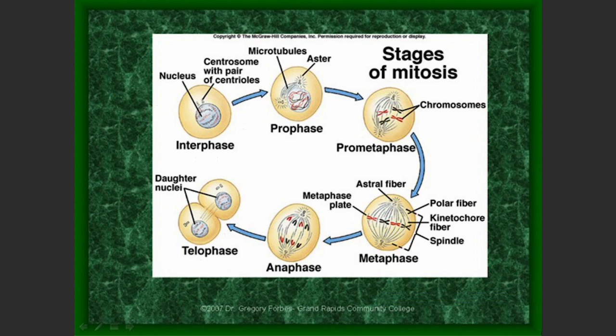We're going to look at slides in just a second and see how to identify each of these stages. Once again, we're not asking you to describe the details of what's happening in each one of these stages. Just be able to identify them. That'll help your conversations in lecture go a lot more smoothly when you get into the details of mitosis. So we're going to go from interphase to prophase, to metaphase, to anaphase, to telophase.